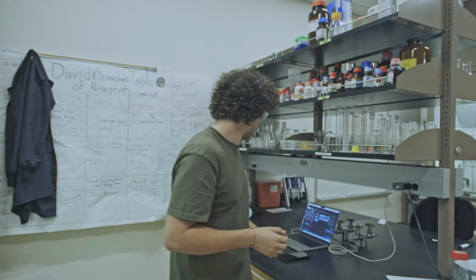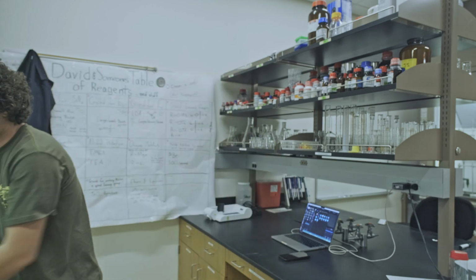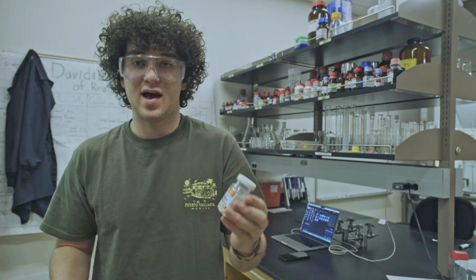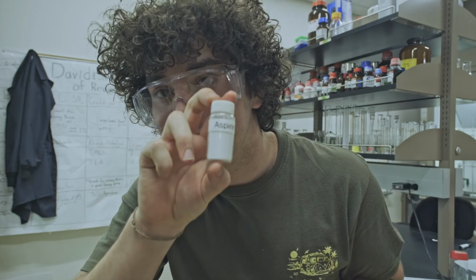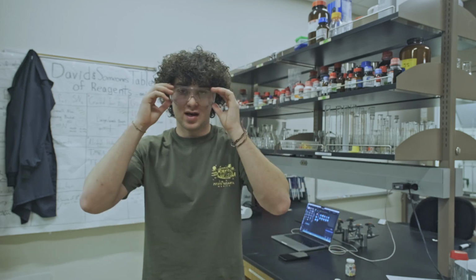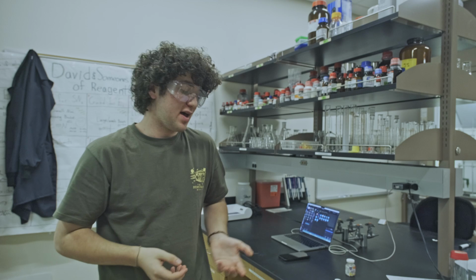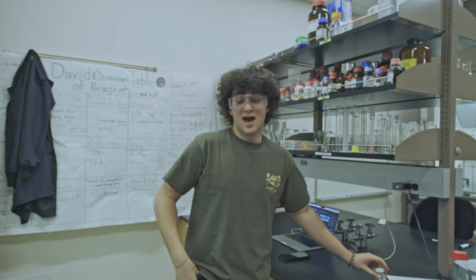I want to thank you guys so much for making it this far into the video. I think that it's pretty safe to say that I successfully made some medicine, some aspirin, the stuff you'd buy at the store. I've successfully synthesized it here. It passed 2 tests. We did a colorimetric test as well as a melting point test, and they were both positive for aspirin.